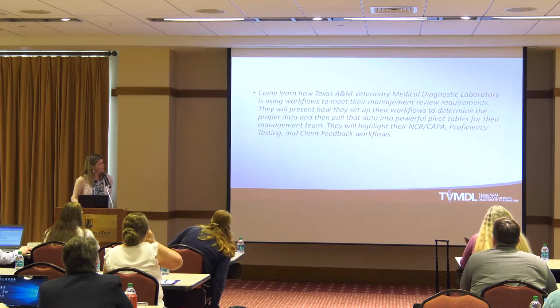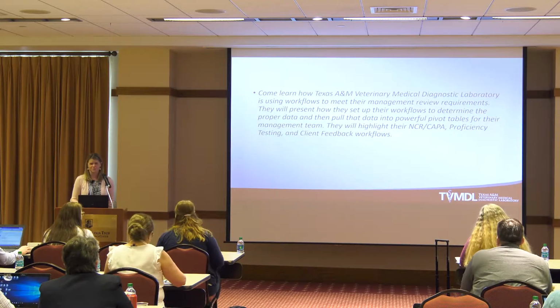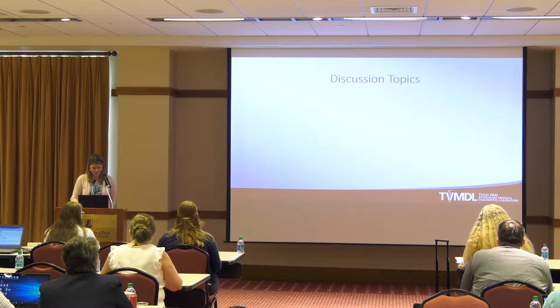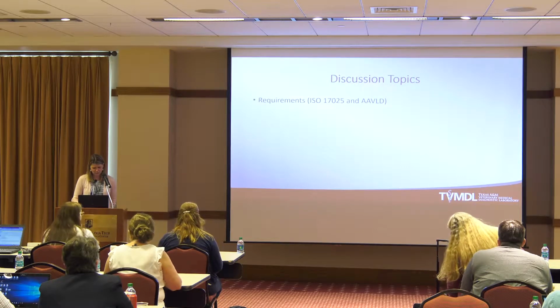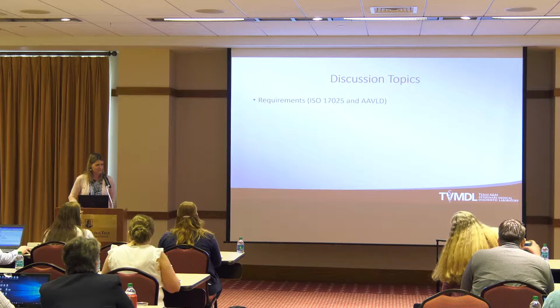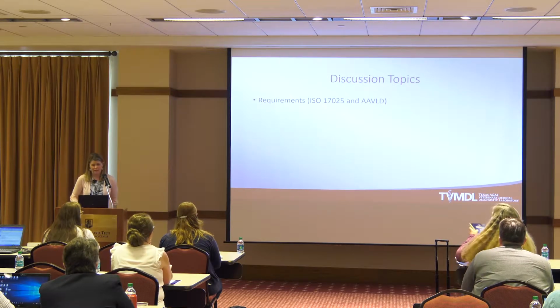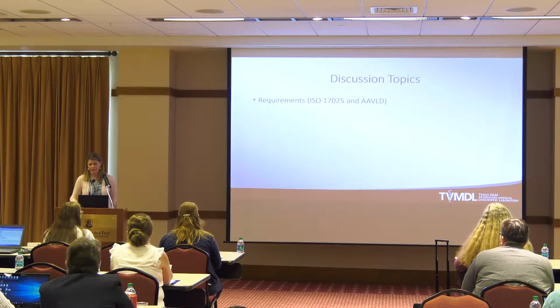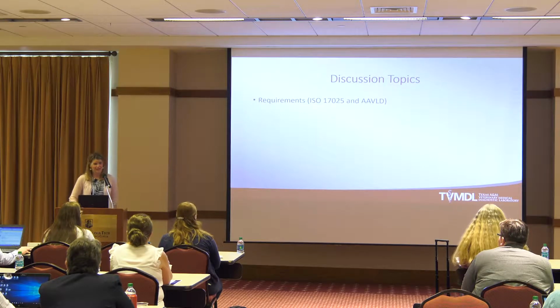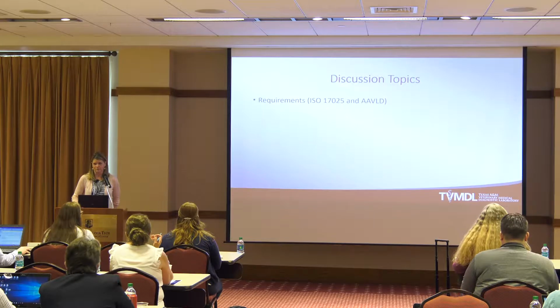You're here to learn how TVMDL uses Qualtrax to prepare management review. So some of the things that we're going to talk about today are the requirements. We're ISO 17025 accredited, and we are also accredited by AAVLD. That means the American Association of Veterinary Laboratory Diagnosticians. The accreditation from AAVLD is based on ISO 17025 standards.